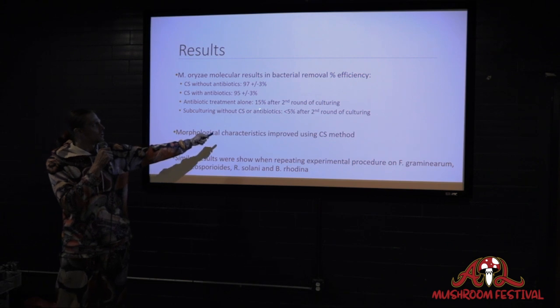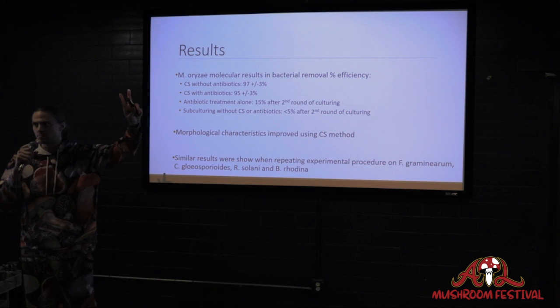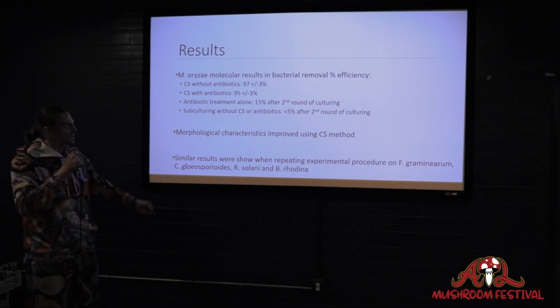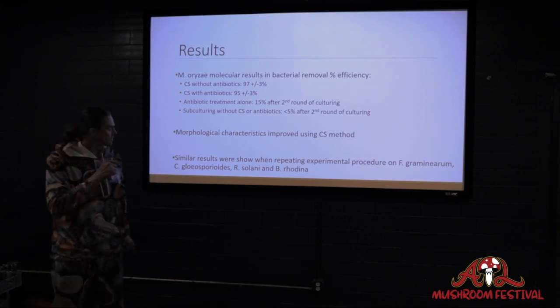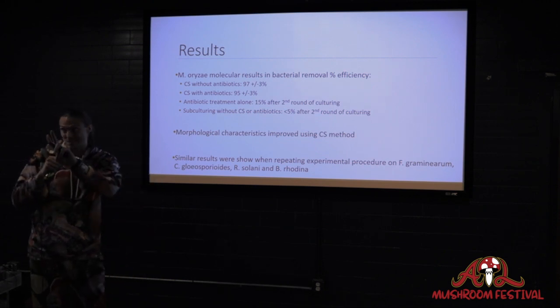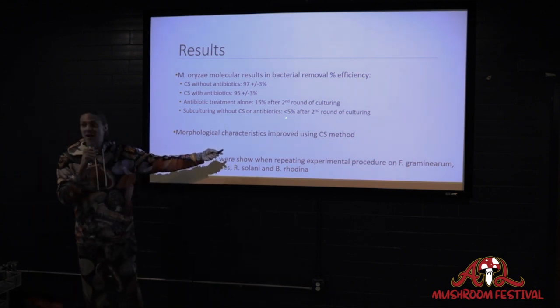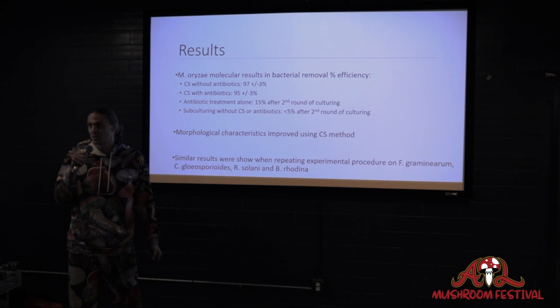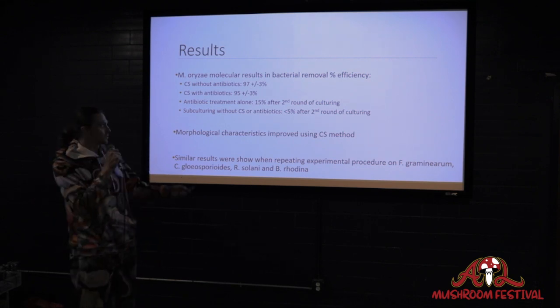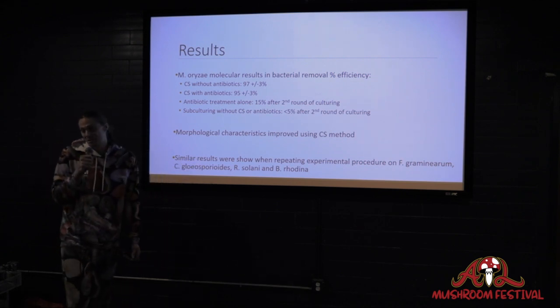Antibiotic treatment alone was only 15% effective after 2 rounds of culturing, 2 rounds of running away from contamination. It was only 15% effective. So, just slightly more than 1 out of 10 plates passed the test after doing this twice. And if you're just using optical isolation, less than 5% effective after 2 rounds of culturing. So if you're just looking at it and hoping that it's not contaminated, there's a greater than 95% chance that it is. And you just don't know it.